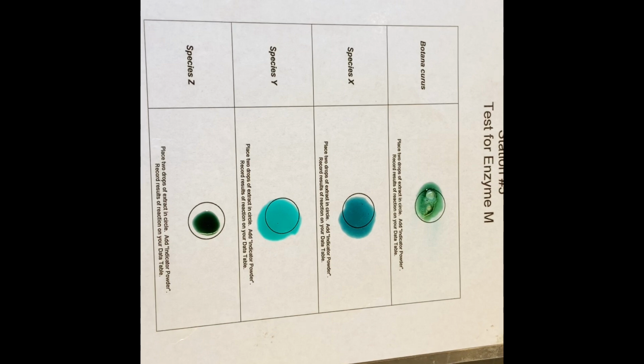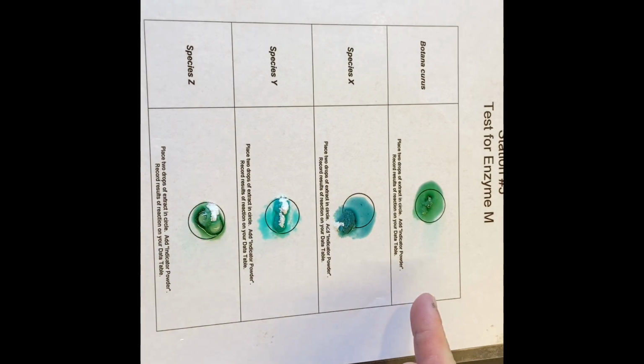In X, no real fizz going on there. Y, a little bit of a fizz. And in Z, very violent fizz once again. Okay, so we have a fizzing, no fizz, no fizz, and a fizz. And that is for the test for enzyme M.